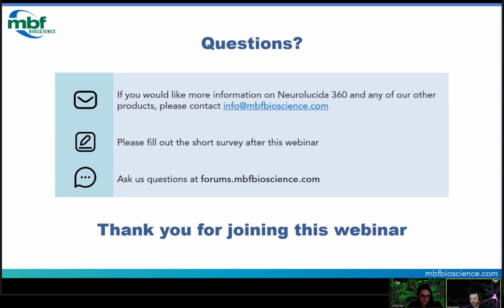And I'll welcome in NL360, or Neurolucida 360, product manager, Macy Heel. Hi, everyone. Hi, Shane. Great job. Like you said, we're really excited that Neurolucida 360, this latest version, is out in the world and ready for all of you to use for your projects. I hope that this new and improved batch pipeline will help you streamline your data collection and help you get the answers you need faster than ever before.